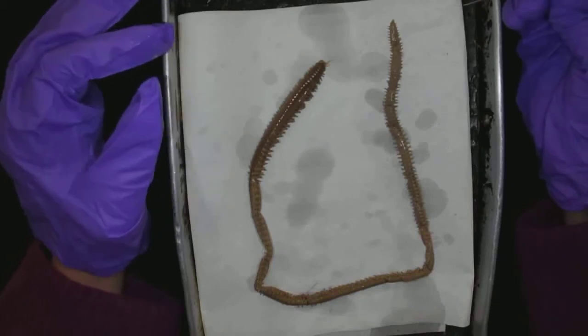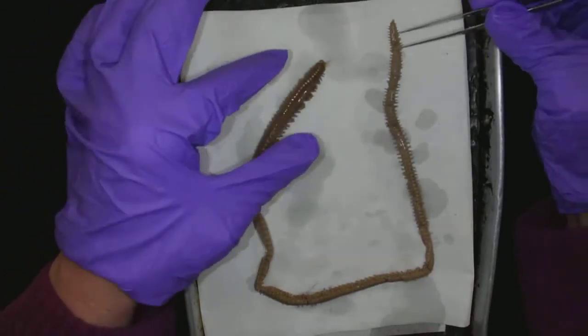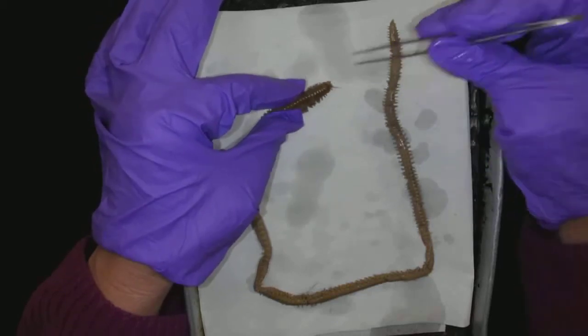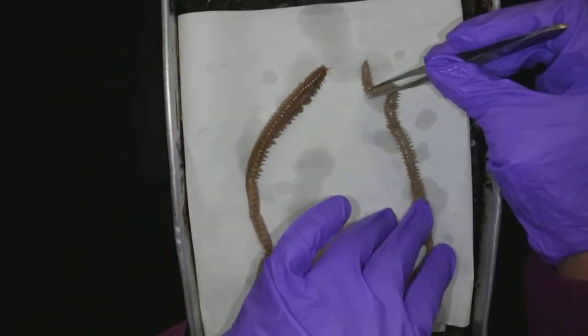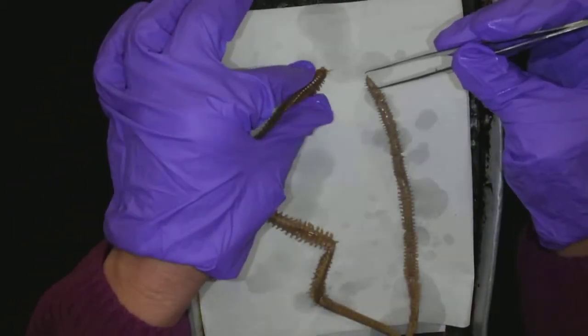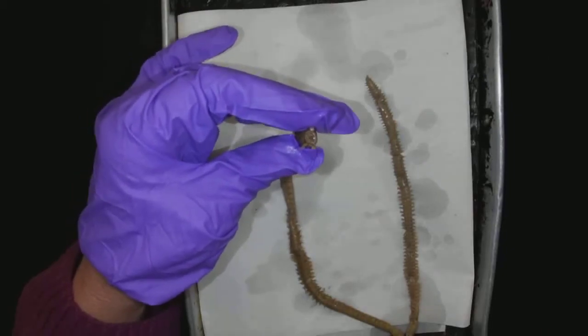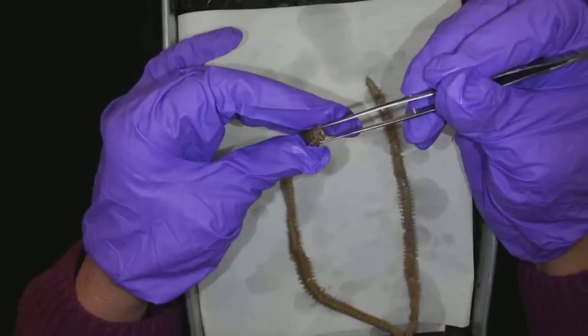This is Nereis. And we are doing just external anatomy on Nereis. So we can easily tell the anterior head from the posterior tail, right? A lot more characteristics going on on this creature here.